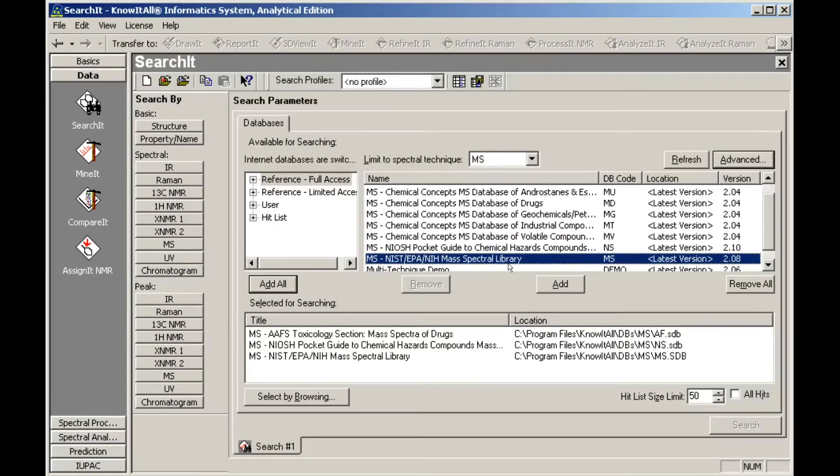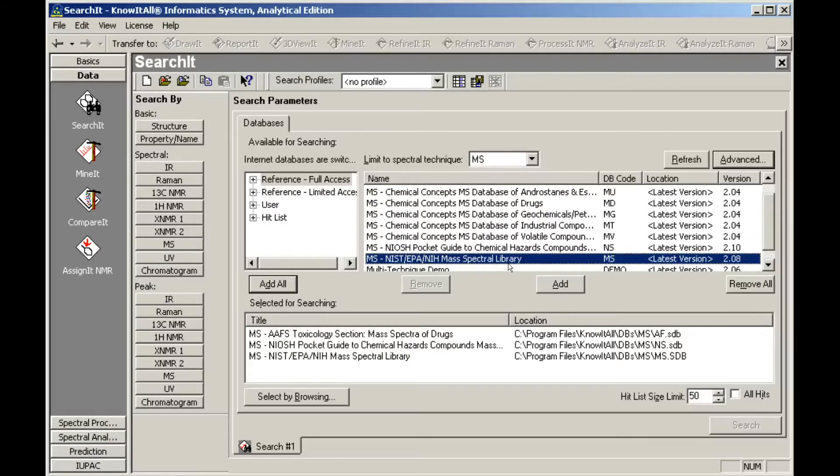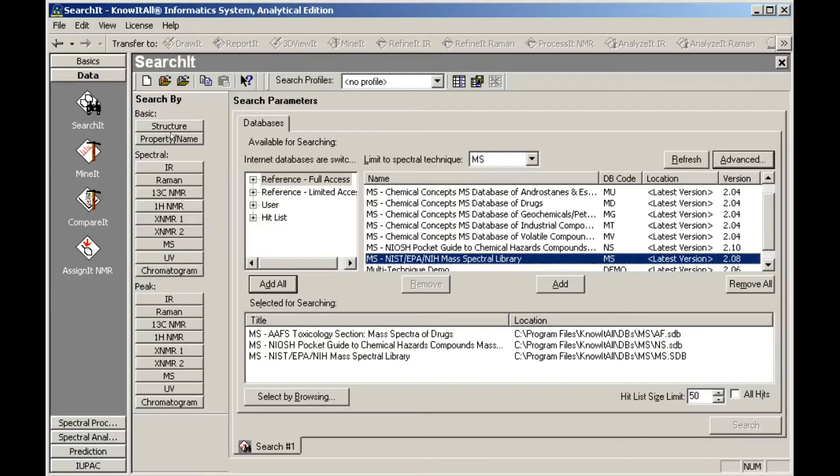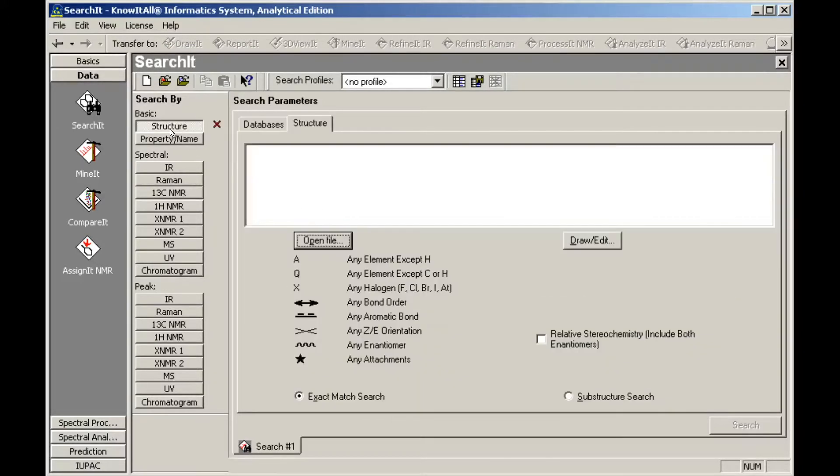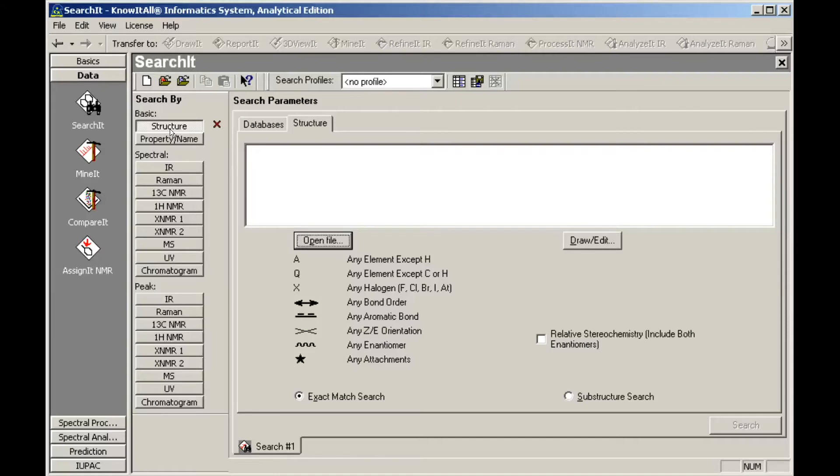Once we have selected the databases we wish to search, we can specify the type of search using the buttons on the search bar. When we click Structure, a new tab is added to the display. Note the red X next to the Structure button, indicating that the search has not yet been properly defined.